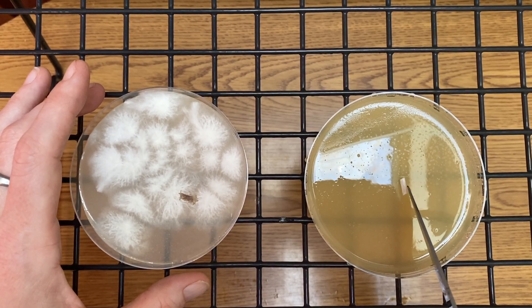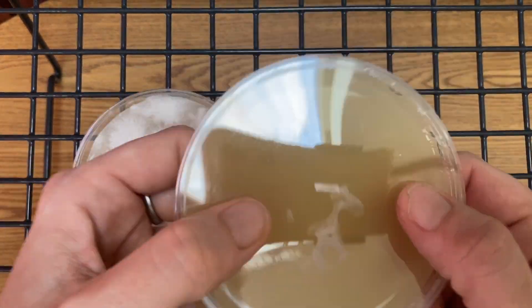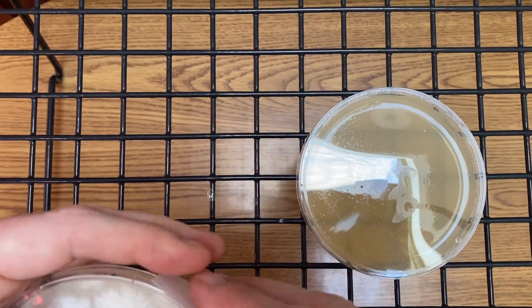And that's it — that's how you transfer rhizomorphic mycelium. Then wrap your petri dish with parafilm.